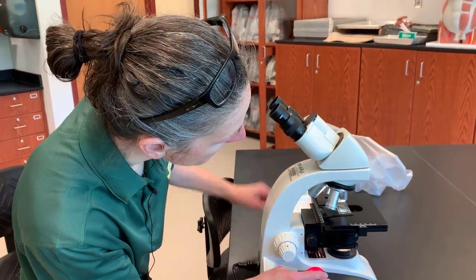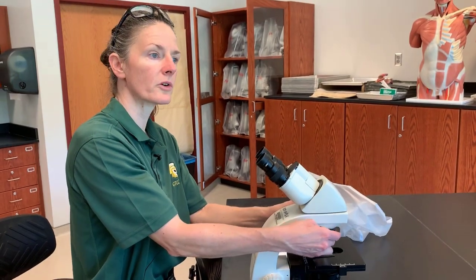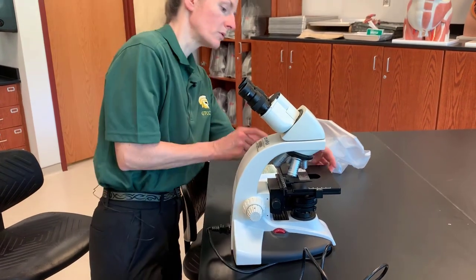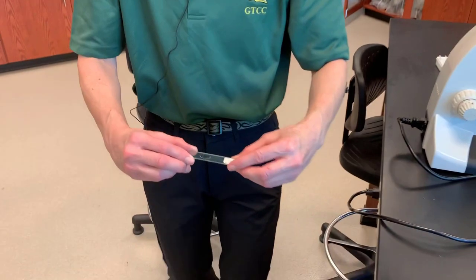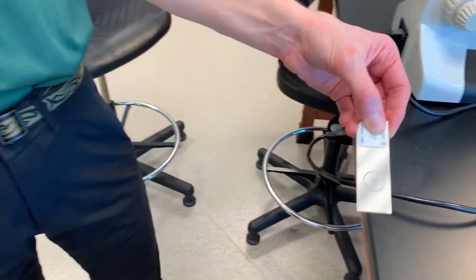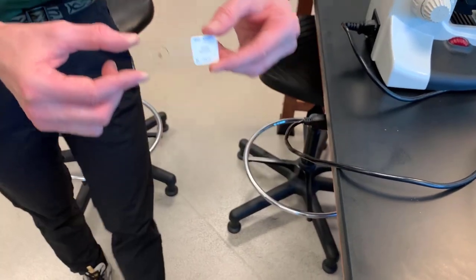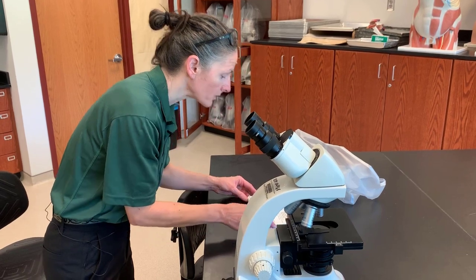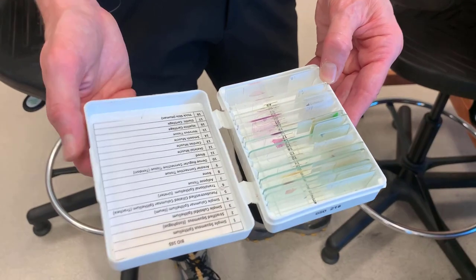When you put the microscope up, we always return it to the scanning objective — this is first and foremost. We always want to store it with the scanning objective. We will turn it off. We will remove the slide, and we always handle the slides by the edges or by the label as well, but we do not want to put our sticky fingerprints on it, as that can obscure the specimen. We put it back in our slide box and then we are ready to put it away.